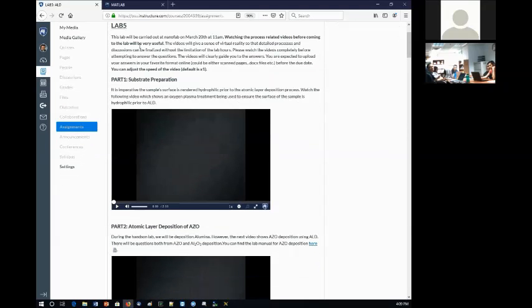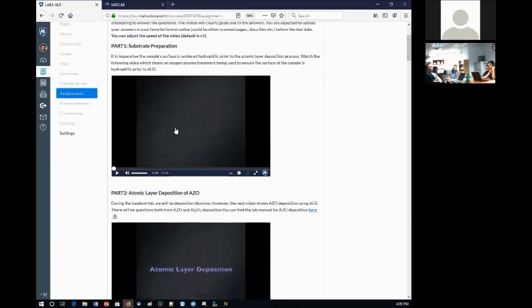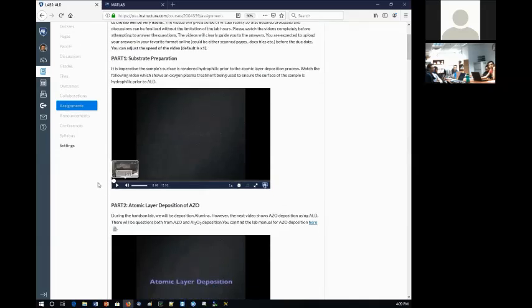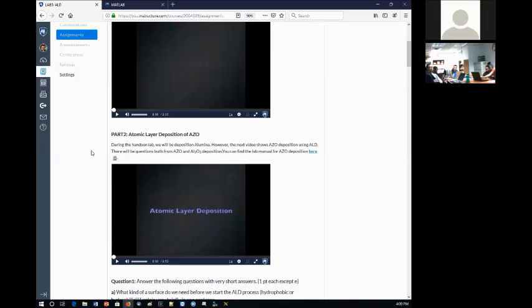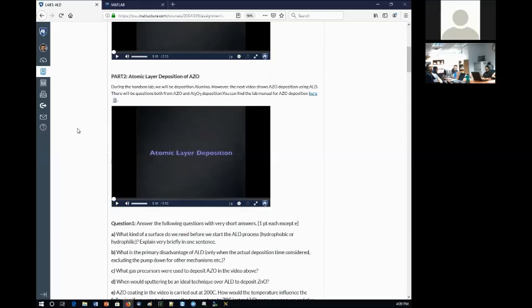So before going to the atomic layer deposition, of course, you need to prepare your substrate. So Rene has uploaded some videos for you guys to watch. Okay, just watch the videos. This is gonna walk you through the whole atomic layer deposition of the AZO, aluminum zinc oxide, that we are gonna cover. Just to give you a brief, quick look.